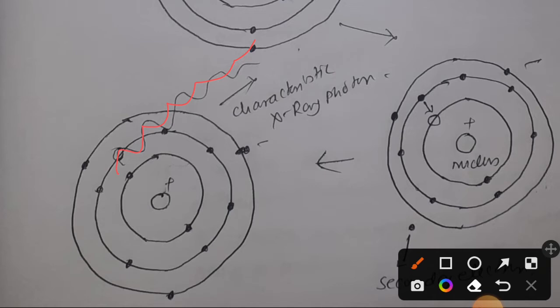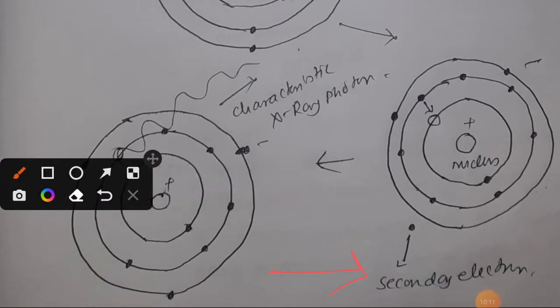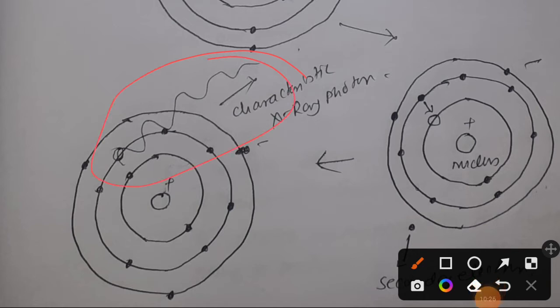One is the scanning electron detector or the secondary electron detector. And what is a secondary electron? The electron that is knocked out by the primary electron, right? And where is it situated? It is situated in the inner shell, right? So now, another detector is the X-ray detector, which will detect the energy emitted by the electron during the jump from the outer shell to the inner shell.